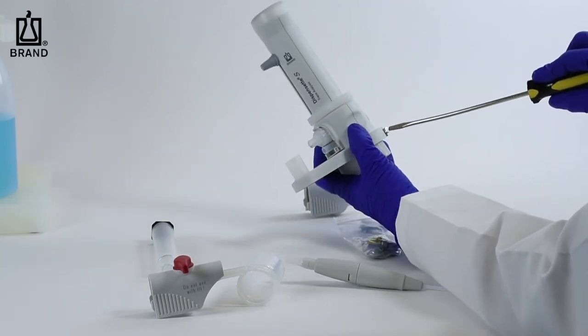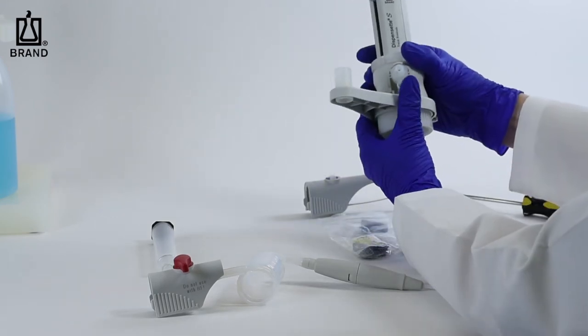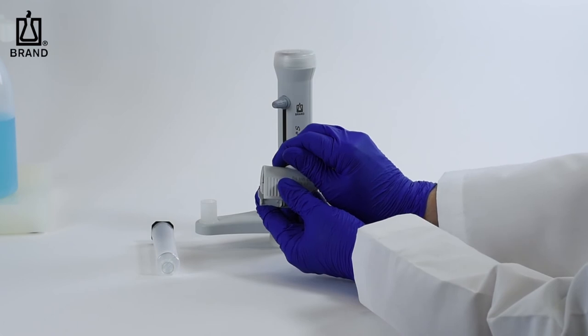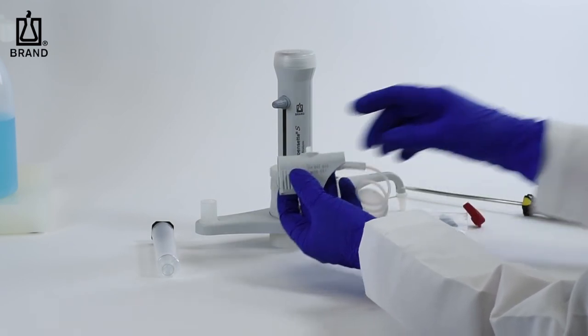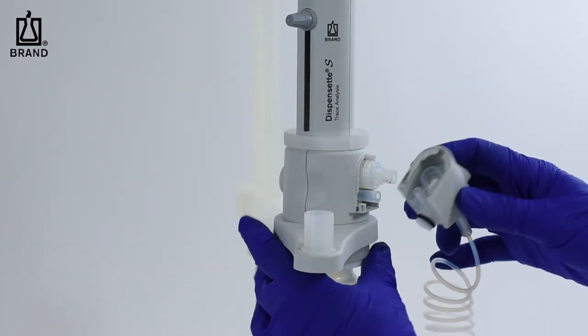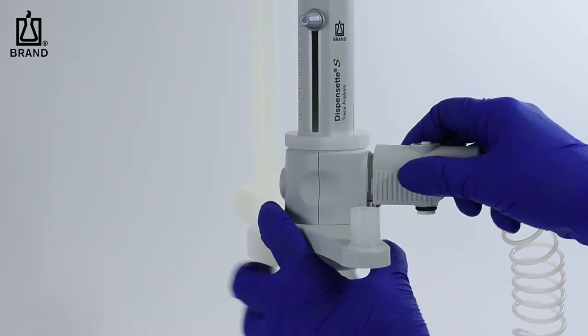Remove the flexible discharge tube from the bag and remove any packing materials. Remove the colored valve cap. Prior to mounting the flexible discharge tube, push the recirculation valve plug down. Then push the tube onto the valve block of the instrument.